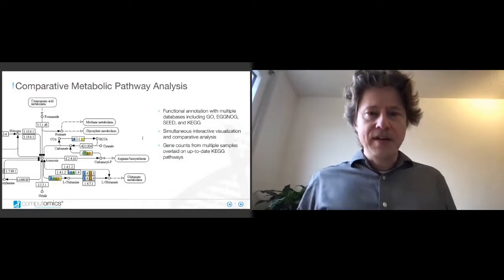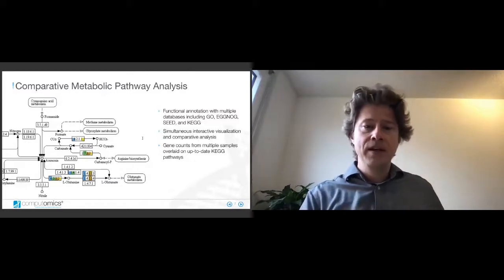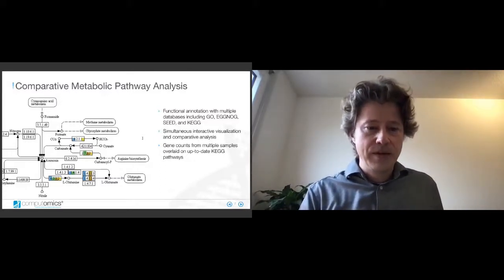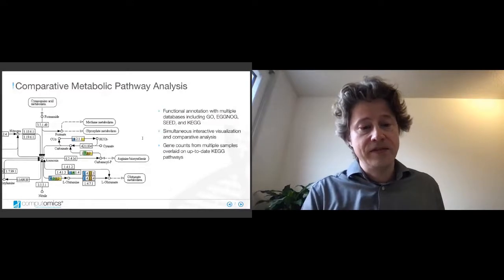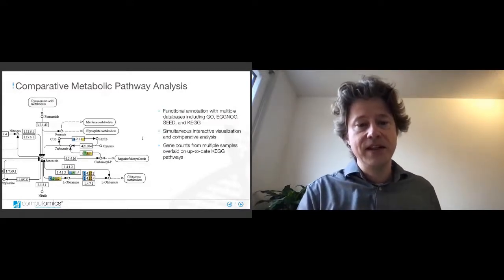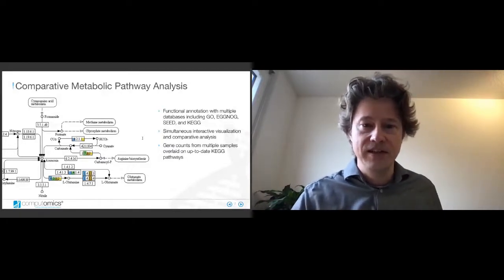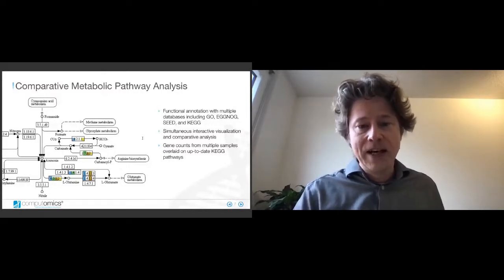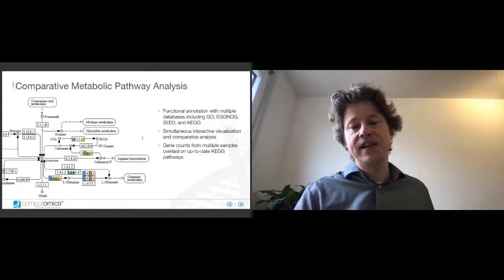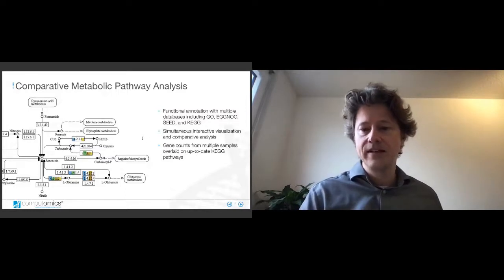Okay, so this is our recommended data analysis workflow for MEGAN. So you start with raw sequence data from your samples. You align them against the reference database. We recommend NCBI-NR because it's the largest database available. Using Diamond, so it's nice and quick. You generate alignment files. The alignment files need to be MEGANized, and then they can go straight into MEGAN for interactive analysis.